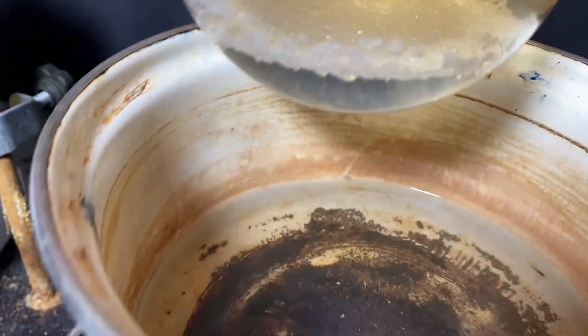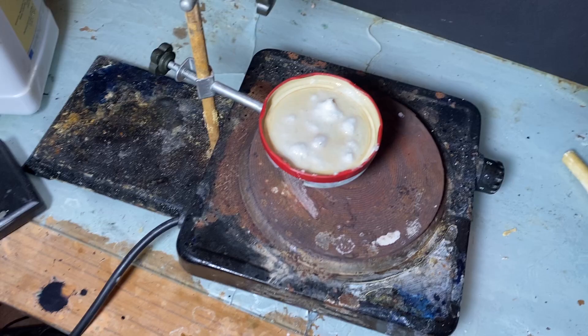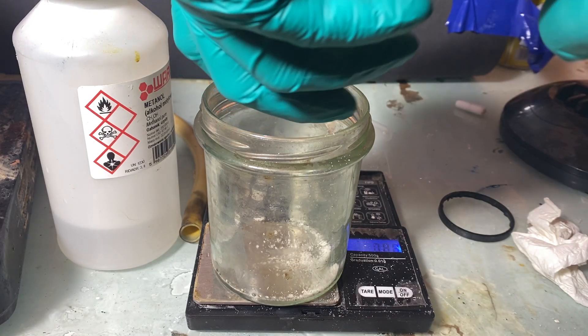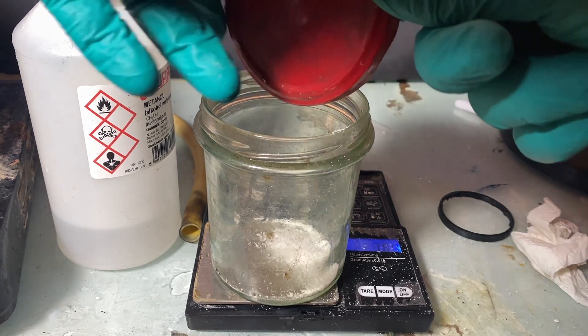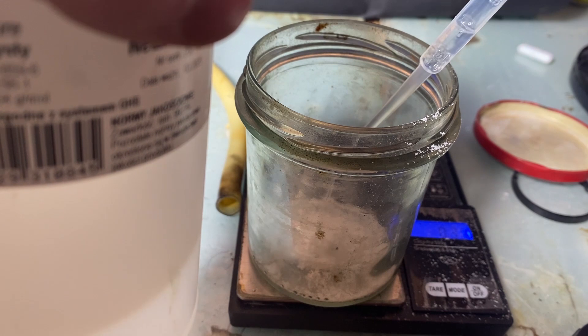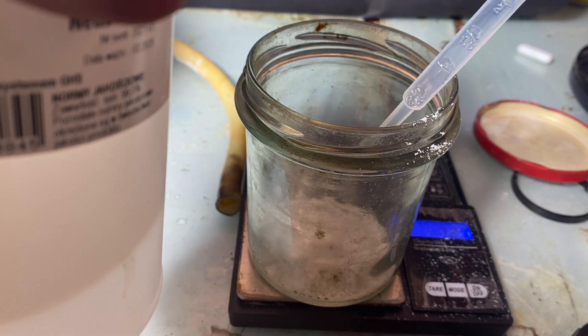Now that we have the main reagent, let's go to making the sclerosis medication. I've got some of the fumaric acid on a jar cap and started grinding it. After the fumaric acid dried out, I tried to weigh out around 1.5 grams of it. Next, I've added around 2 ml of methanol total, plus some for washings. For the reaction to work well, we're going to need a 3-to-1 molar ratio of methanol to fumaric acid.